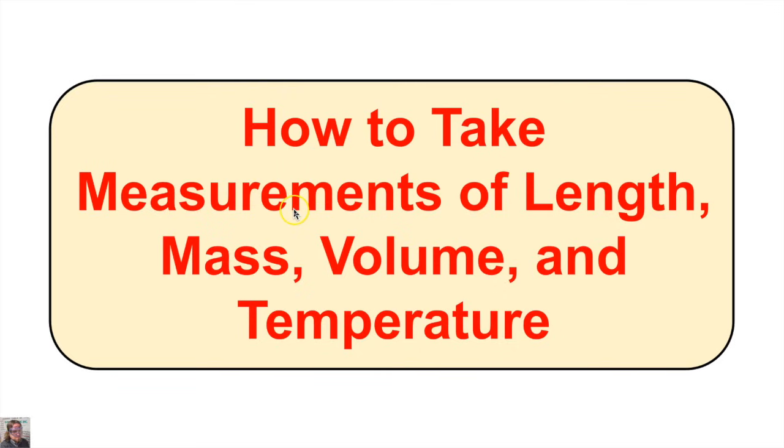In this video we are going to learn how to take measurements of length, mass, volume, and temperature. So let's first take a look at how we are going to measure length.